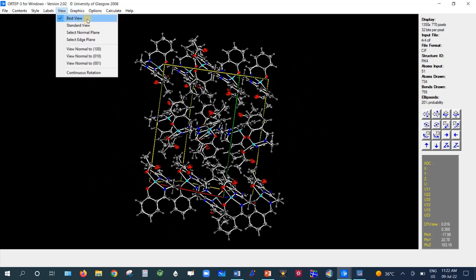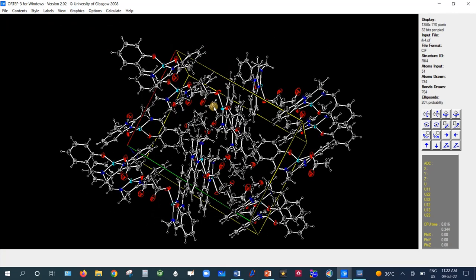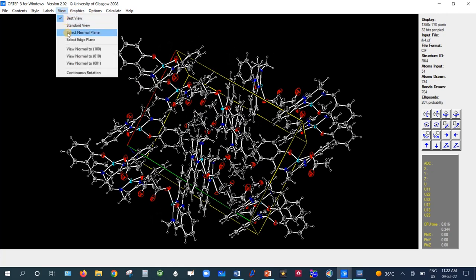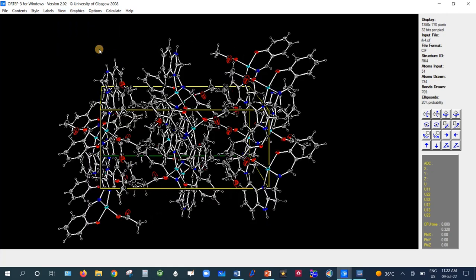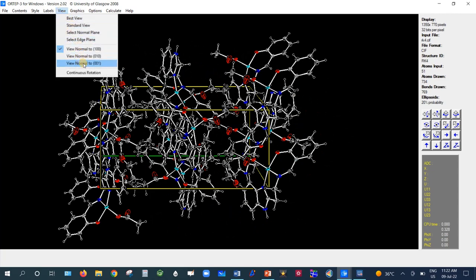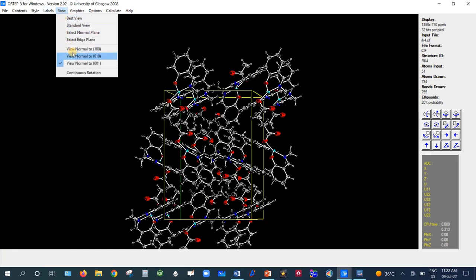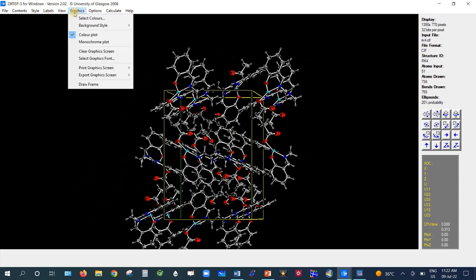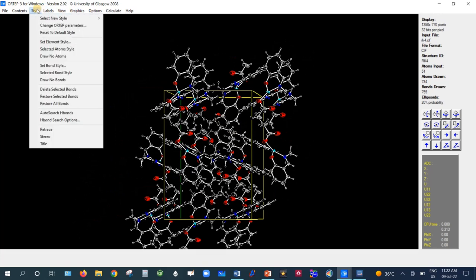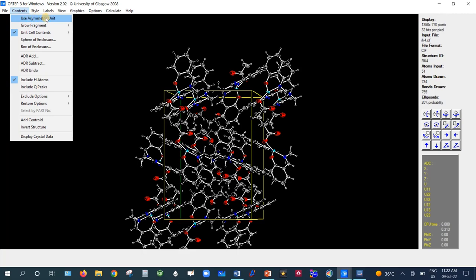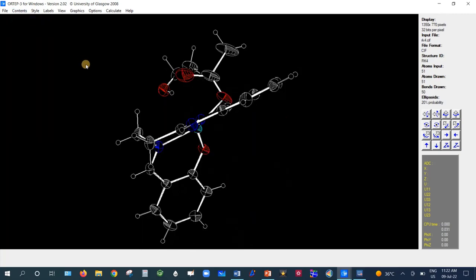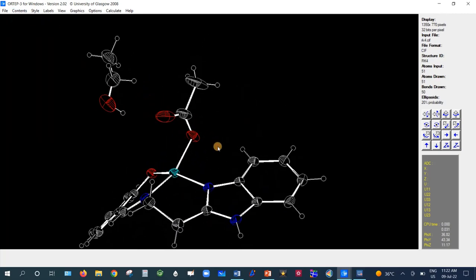There are View options — for example, Best View, or view normal to the (1 0 0) plane or the (0 0 1) plane, among several other options. To return to the individual molecule, go to Content > Use Asymmetric Unit.